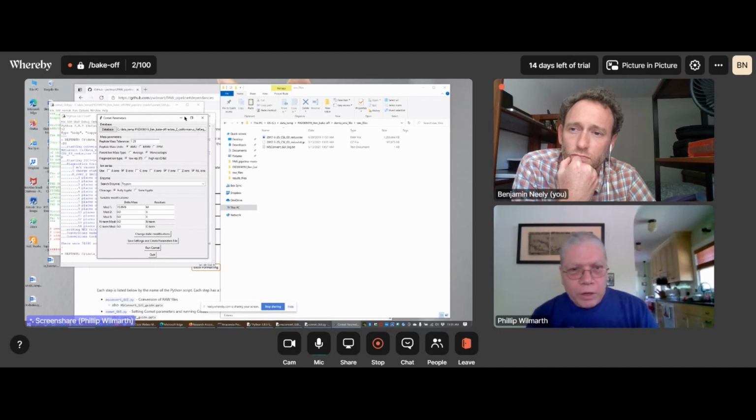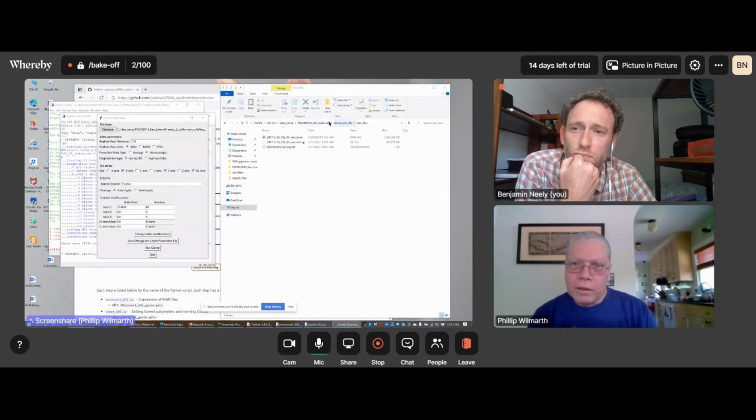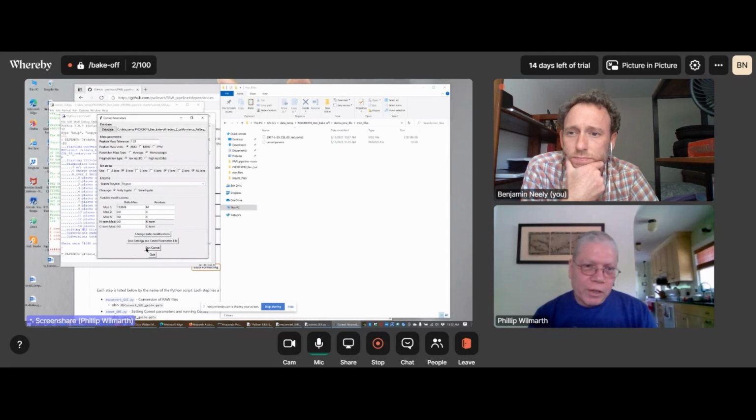So now we've got everything pretty much specified. And then we need to save the Comet params file before we can launch our Comet searches. So we have to go find that MSN folder, select it, and then it will write the Comet file in there. Now if we look at MSN, we've got a Comet params file in there in addition to the MS2 file. Then we can run Comet.